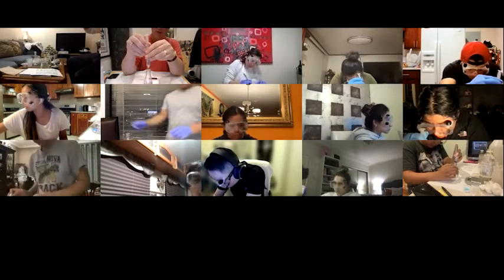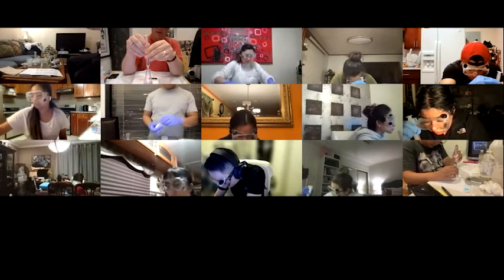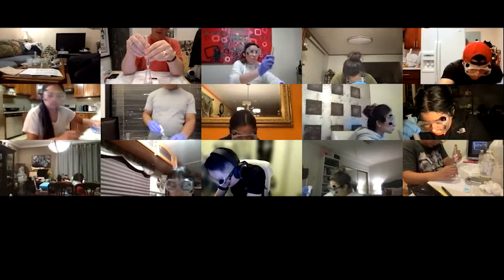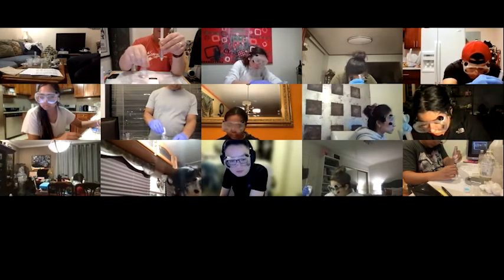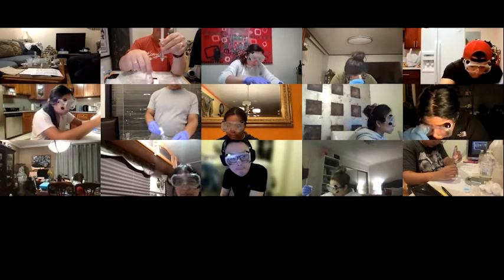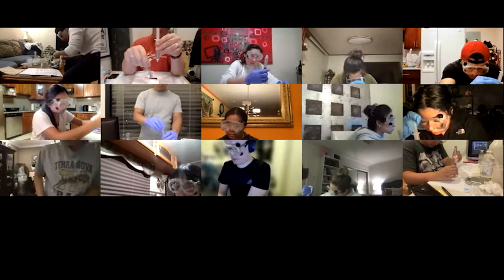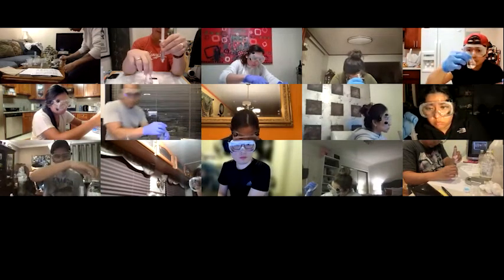I can tell I'm close because it's taking longer and longer for the color to go away. Man, that is close.